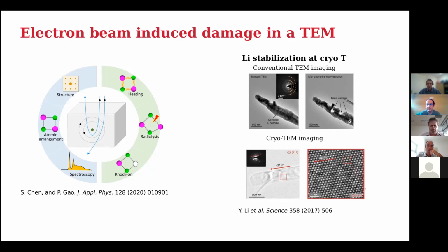The spin-polarized current will be difficult, but what people are doing now, which is more within range, is tuning the phase of the electron. They try to change the electron phase in order to probe different states of the sample. So they are not really trying to work with the spin of the electrons, but more with the phase of the wave. That's something that's under development.